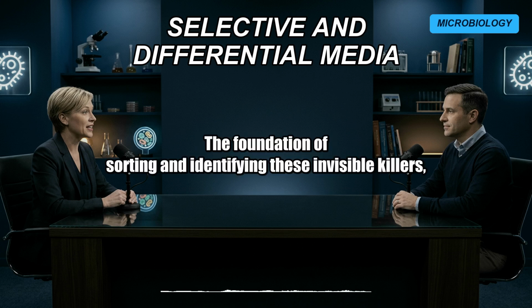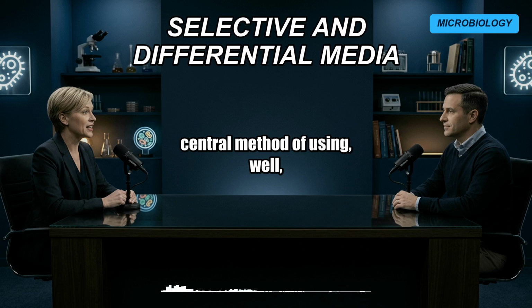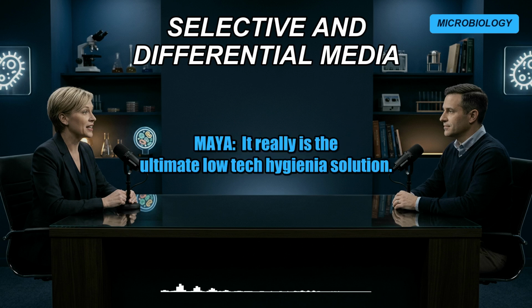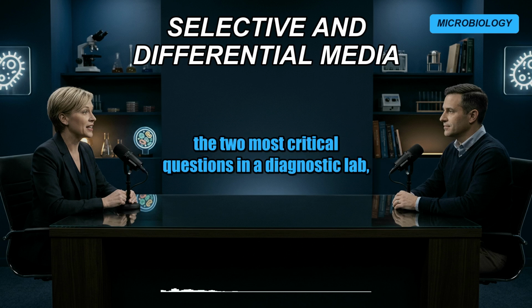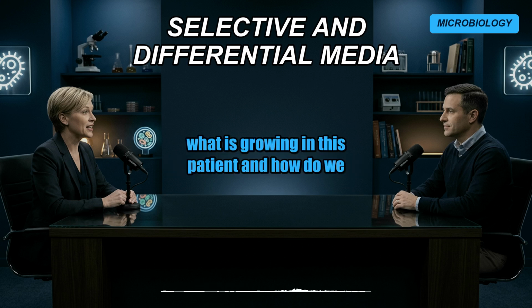The foundation of sorting and identifying these invisible killers doesn't rely on a microchip. It relies on this brilliant, century-old method of using, well, chemically spiked jelly to force bacteria to reveal their true identities. It really is the ultimate low-tech solution. To this day, it's still the absolute fastest and cheapest way to answer the two most critical questions in a diagnostic lab: what is growing in this patient, and how do we kill it?